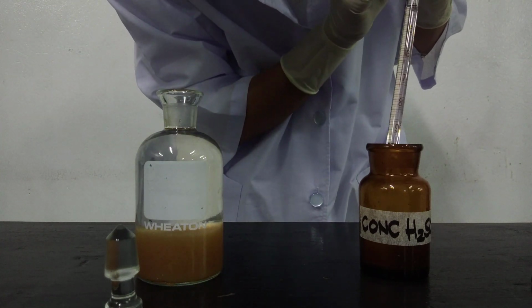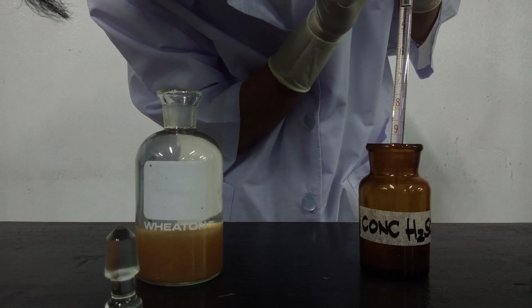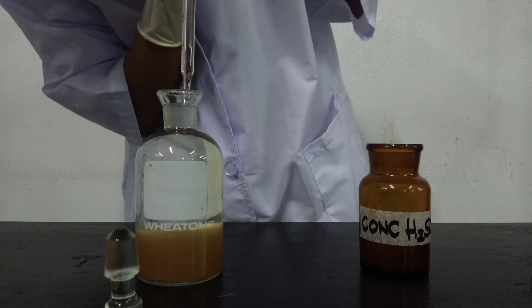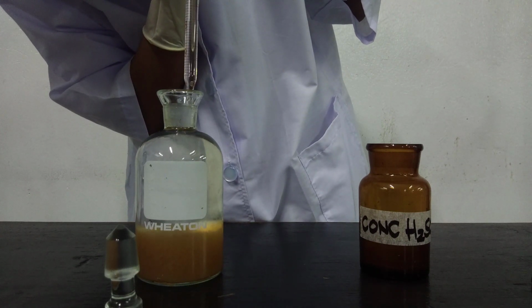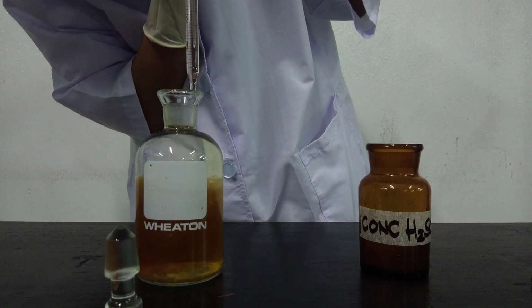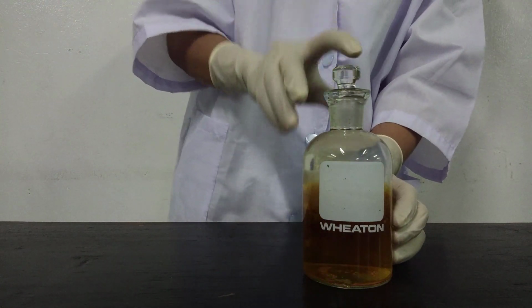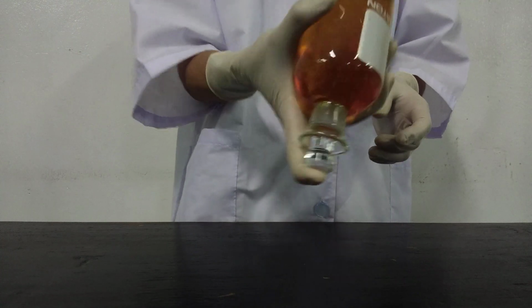Now we add 1 ml of concentrated sulfuric acid down the side of the bottleneck using a pipette and aspirator. After this, stopper the bottles and again mix by gently inverting until the precipitate is dissolved completely.